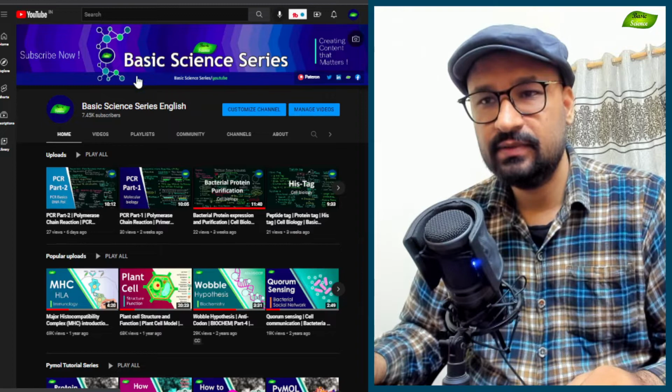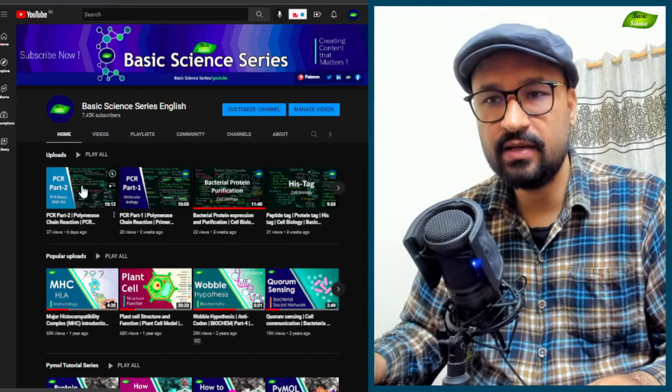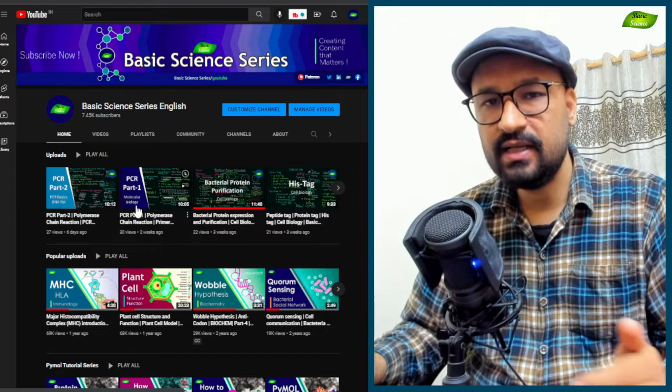is the Basic Science Series channel. And recently I posted some videos, as you're seeing, on polymerase chain reaction. So PCR1, PCR2, these are some of the videos on polymerase chain reaction. And what I'm doing in these videos is trying to make you understand the basics of polymerase chain reaction. And in those, I have discussed the basics of primer designing also.